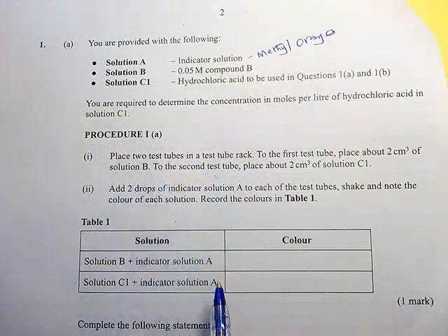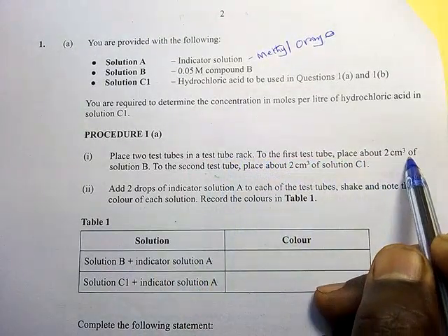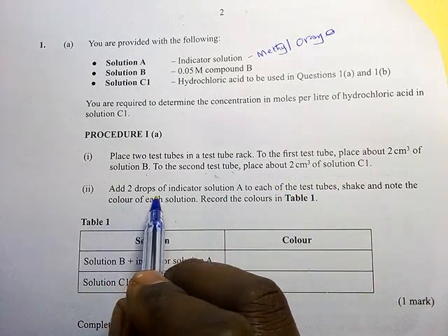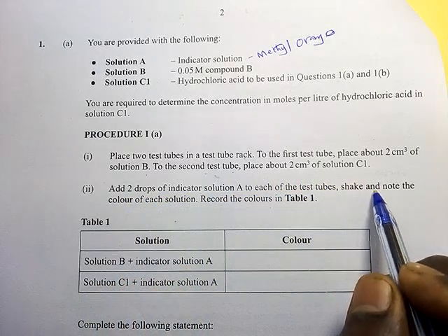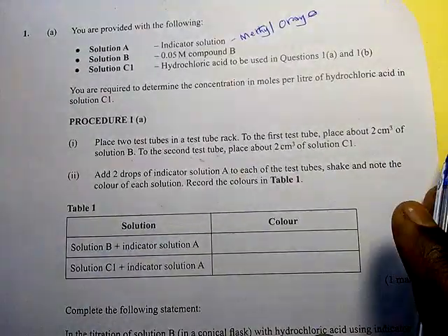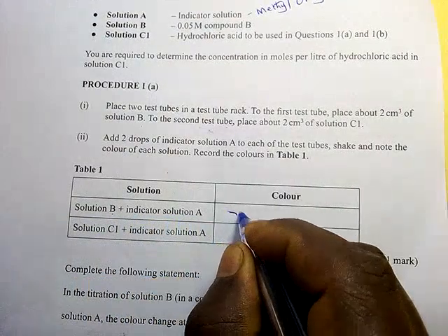So procedure 1. Place 2 test tubes in a test tube rack. To the first test tube, place about 2 cm cube of solution B. To the second test tube, place about 2 cm cube of solution C1. Add 2 drops of indicator solution A to each test tube. Shake and note the color of each solution. Record the colors. So the students were supposed to record the color. Solution B, which we don't know, plus indicator A, the color was yellow.